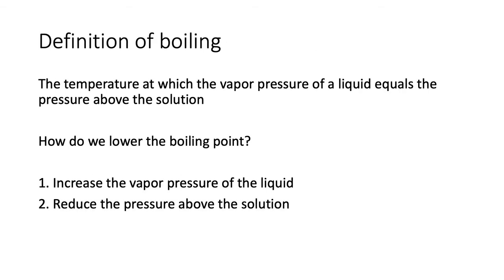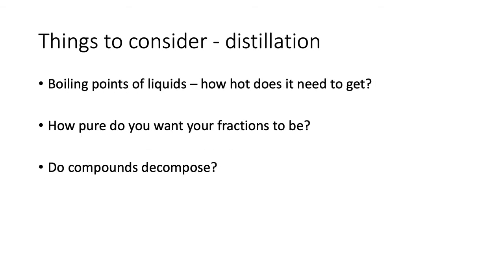So if we heat our compounds too high, they have a pretty high boiling point, if you remember back or if you look back in your slides. If we try to heat them aggressively to that boiling point, then our products may decompose before we can collect them. So we have to figure out a way to make things boil at a lower temperature.